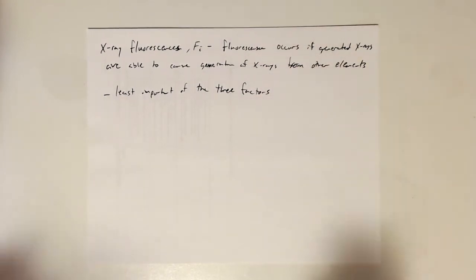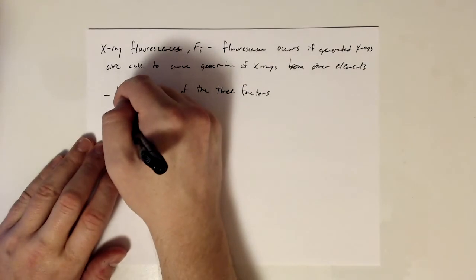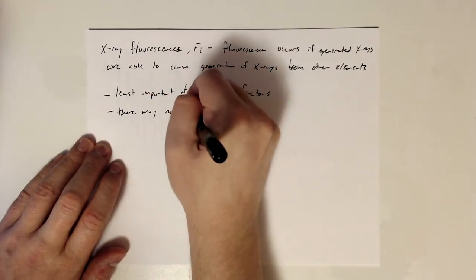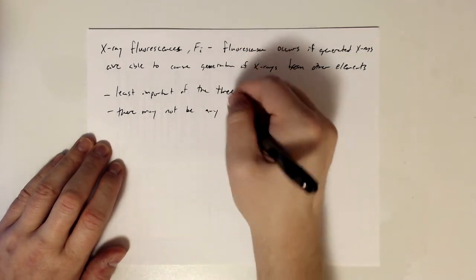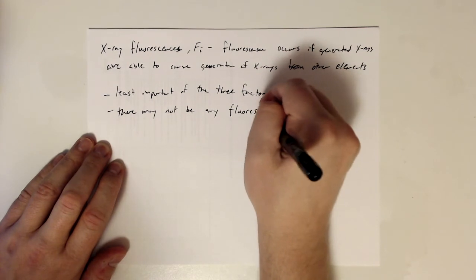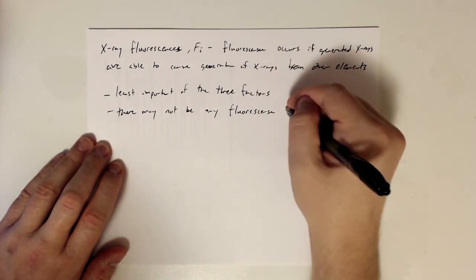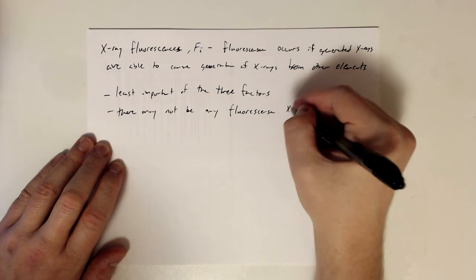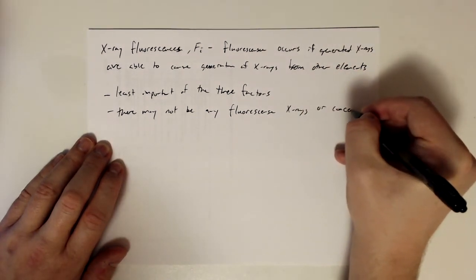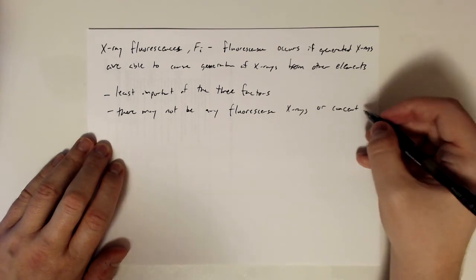It's not to say we can ignore it, but of the three, this is least important. So there's actually a chance that there may not be any fluorescence, or concentration may be small.